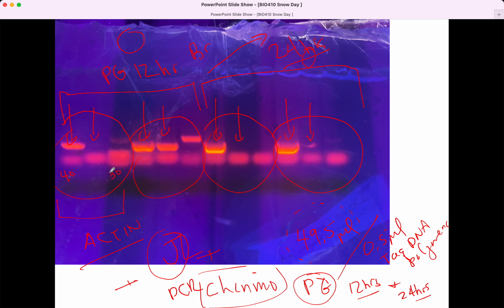The concern would be pipetting errors, right? We're beginning pipetters, even the experienced students, and we really need to help each other and really practice that. Then second group, lots of this JL product. Then third group, none. The fourth group, maybe a little bit. There's that mark there, and it could be a little bit.